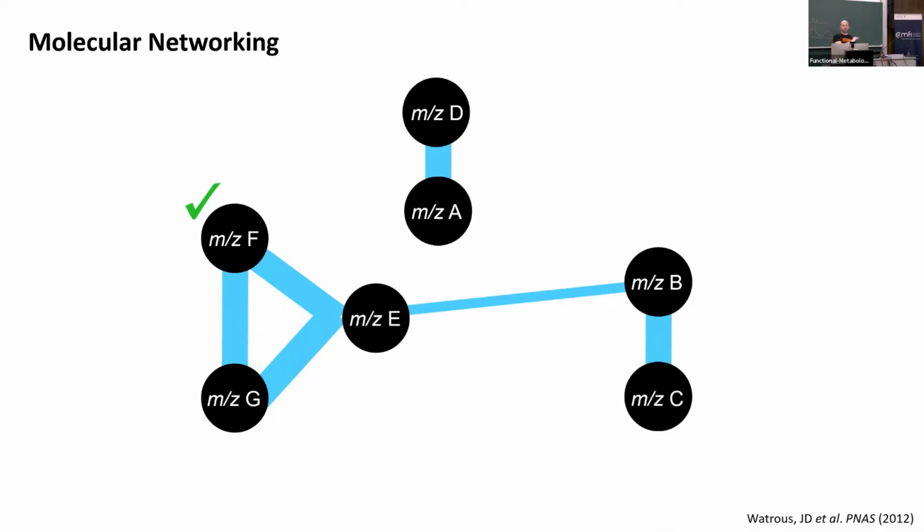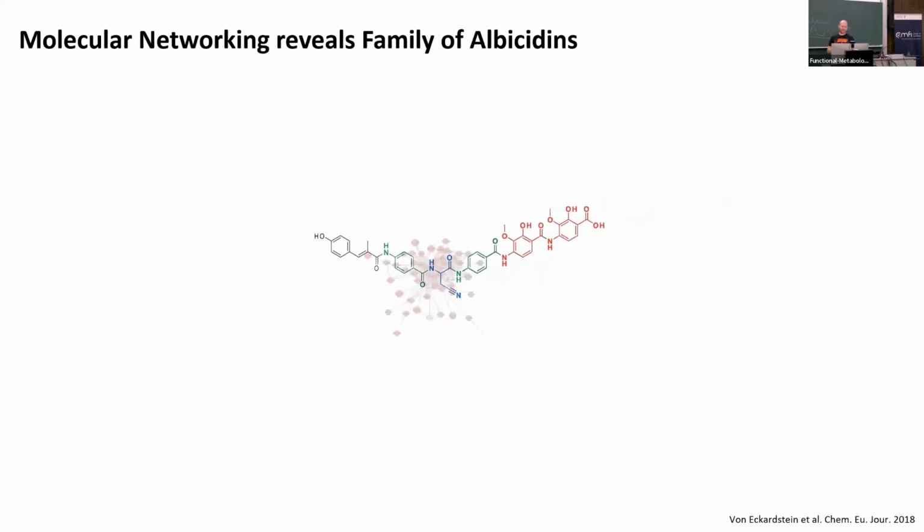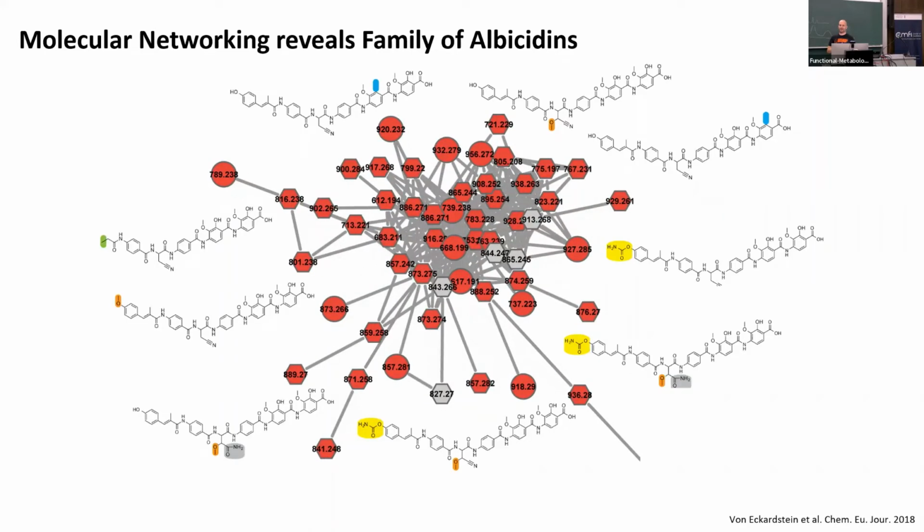That was before I knew about molecular networking. When I learned about it and systematically reanalyzed the non-targeted data I had, it was really interesting, because all these other molecules would also appear, and I thought, oh wow, that's an even bigger network, and there are way more analogs inside that data than I thought.